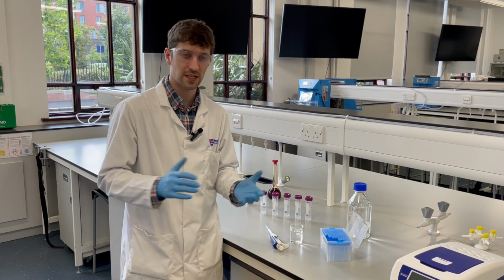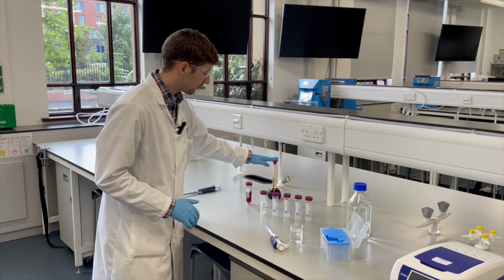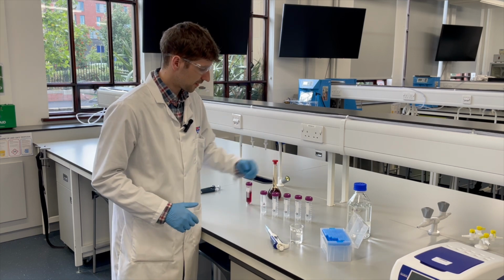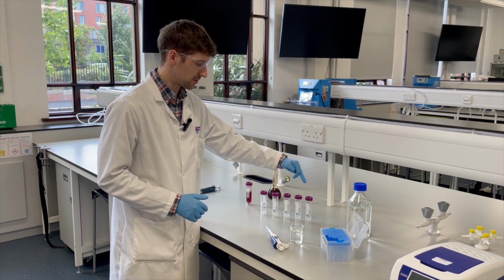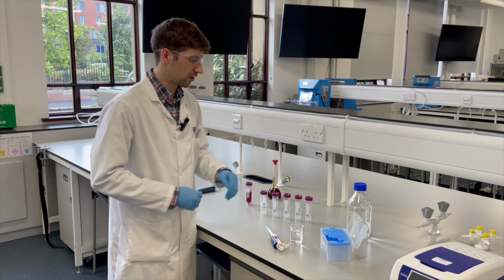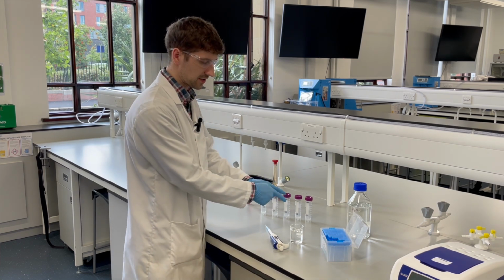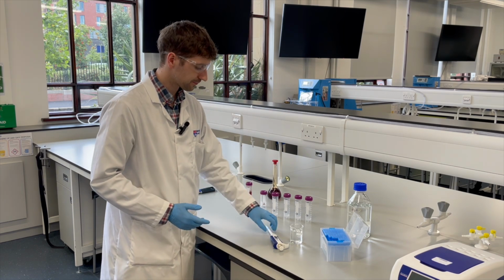So, sounds sensible. How do I perform a 1-in-1 or half dilutions in each of these volumes and make sure that I end up with 4 mils in each of these vessels at the end, okay?